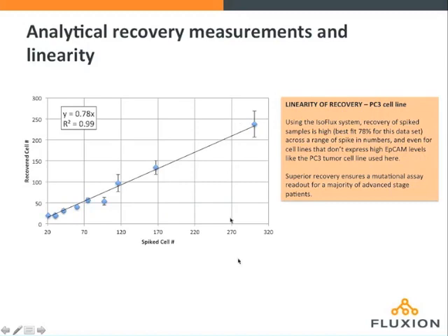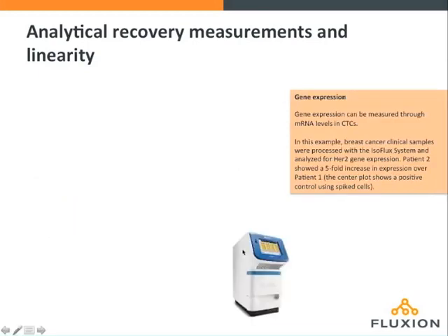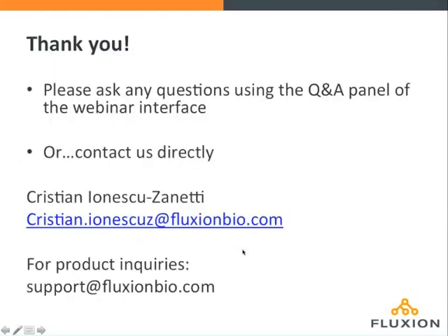There was another question about the possibility of doing cell culture post separation in the IsoFlux system. I can tell you that the cells are viable, and we've done some work that indicates we can extract cells post separation and culture them using primary ex vivo cells. However, I will say that this is a challenging application, and that more work would need to be done to do that on a routine basis. And happy to talk to you more about our experiences there.